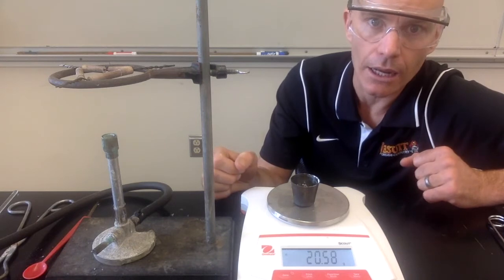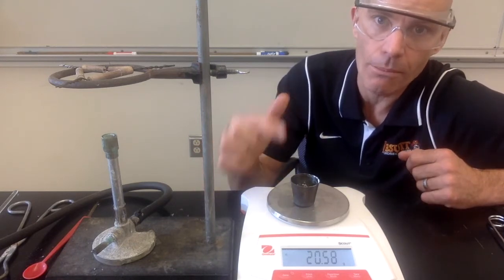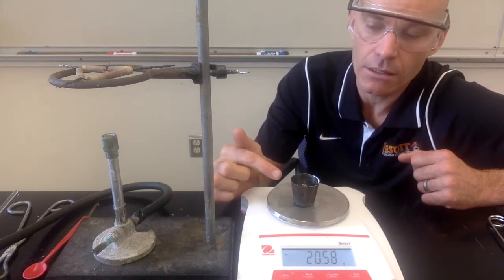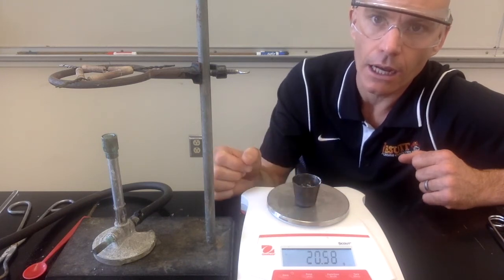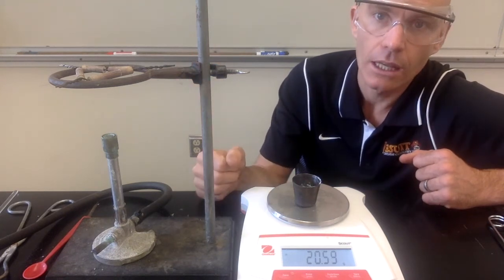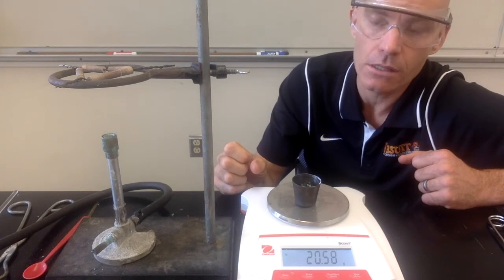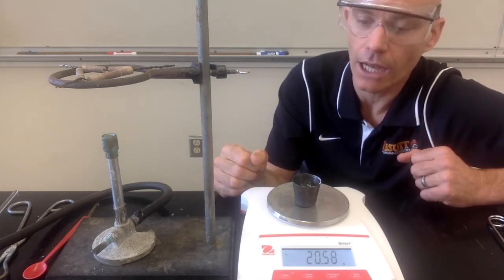Now for the calculations: you know the mass of the hydrate at the beginning and the mass of the anhydrous salt at the end — the anhydrous salt is just the copper sulfate without any water in it. You subtract those to see how much water was lost. Once you know how much water there was and how much anhydrous salt there is, you can find the mole ratio between those two things and determine the formula of the hydrate. Use the mass after the final heating, not after the first heating.